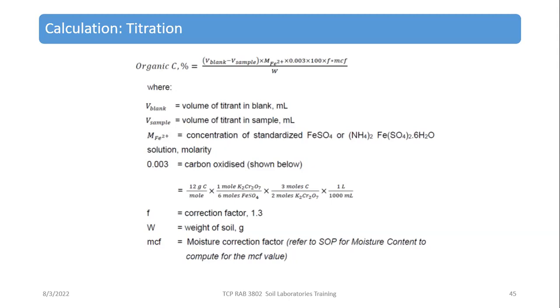And M Fe2+ is the concentration of standardized ferrous sulfate or ferrous ammonium sulfate, molarity.